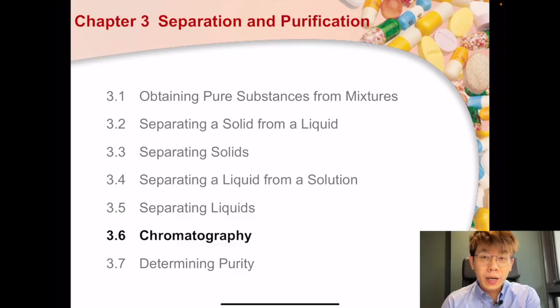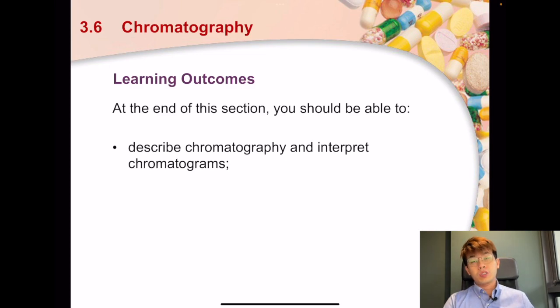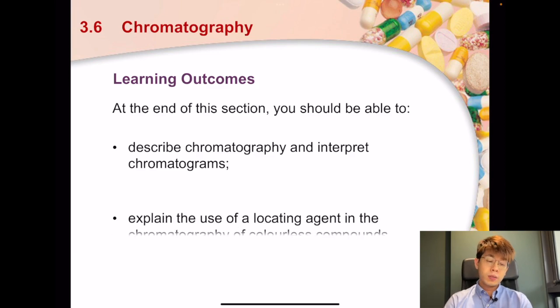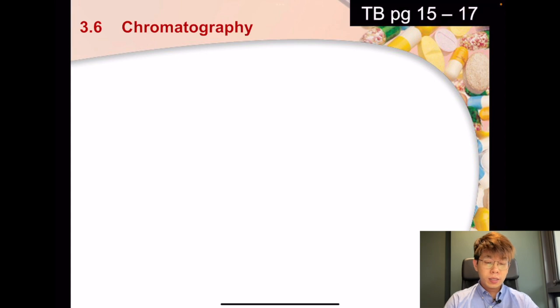Okay, so we are at chromatography right now. Chromatography is a very interesting procedure. For chromatography, you must be able to describe what chromatography is and how to interpret the chromatograms, and also understand what a locating agent is.